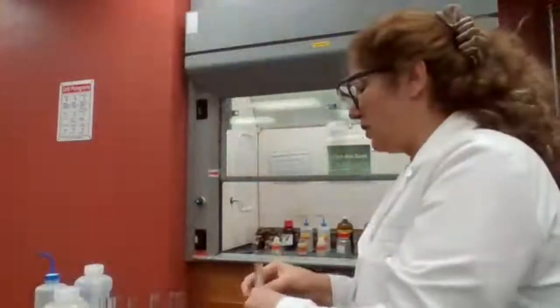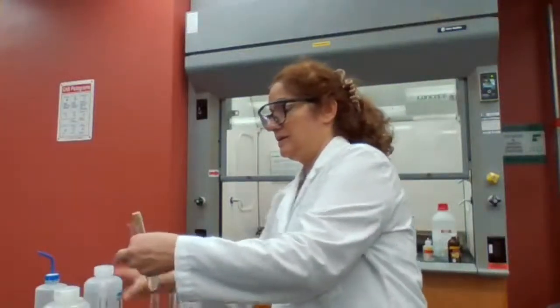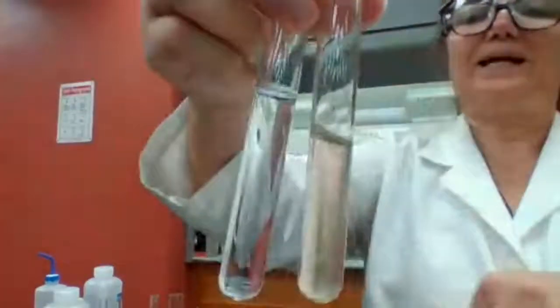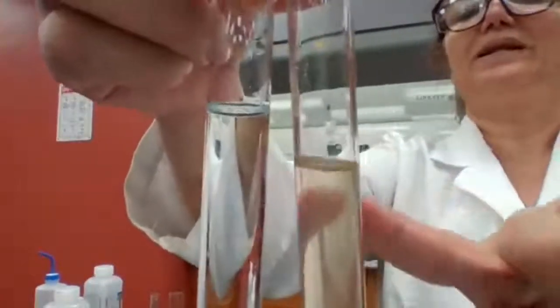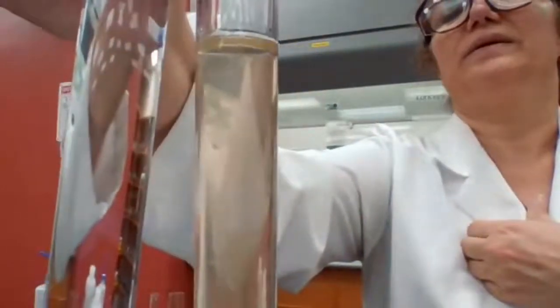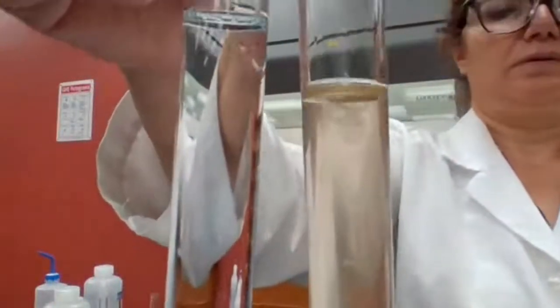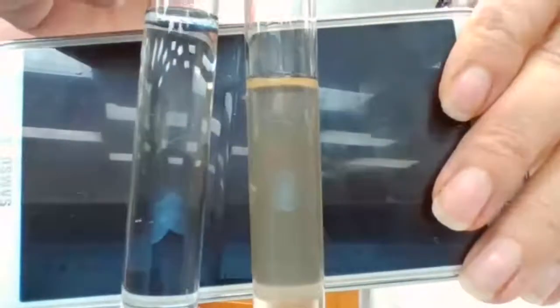It's not as clear as water. See? If you compare with the water, it's not as clear as water. It's slightly cloudy, but I don't see solid precipitate after adding HNO3. It's just cloudy. I don't know. Can you see it as cloudy or is it not cloudy for you at all? Slightly cloudy, okay, but it's not very strong.